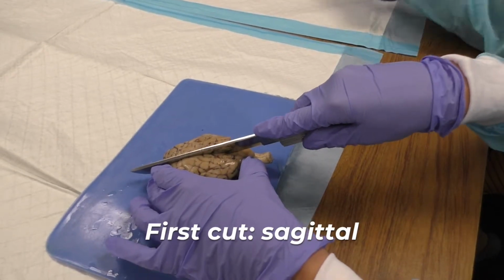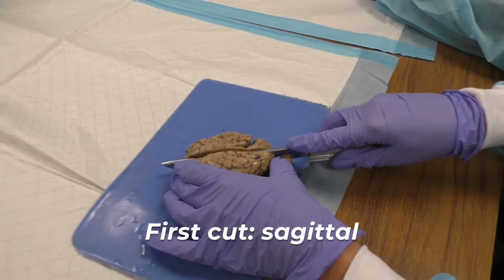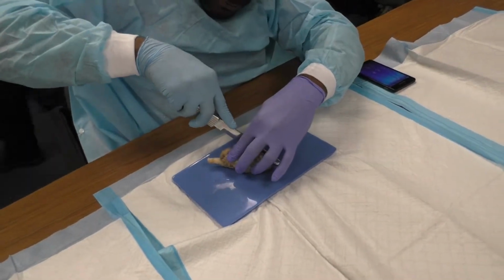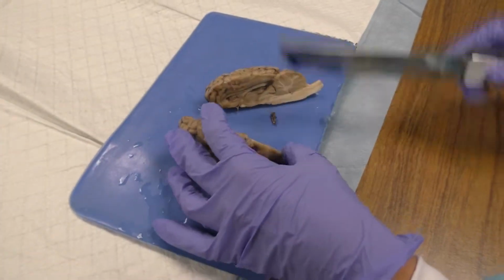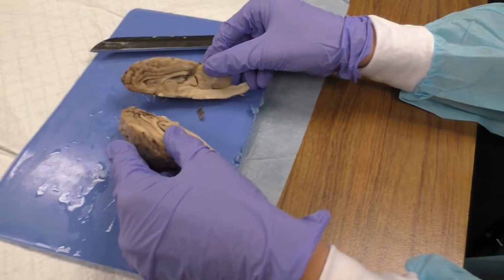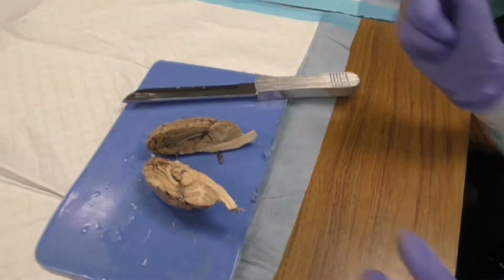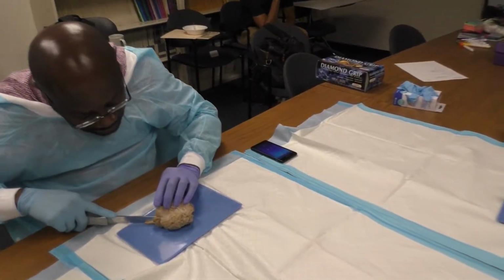Okay, we're now starting the first cut. And this patient has been anesthetized, so don't worry, students. He's not feeling any pain. Nice. All the way through the stem. All the way through the stem. Nice.